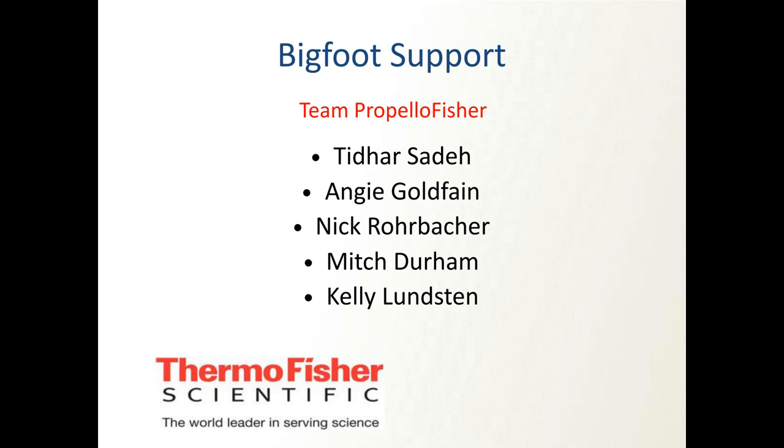One of the issues with Bigfoot that I know is being fixed right now is that when you run your controls, you aren't able to visualize them afterwards. They're just basically processed in the unmixing algorithm, and that's that. You don't actually save them as a sample. So we've gone back and run the controls as a sample, which takes a lot of work in a 22 color panel. And that's what we're looking at right now.